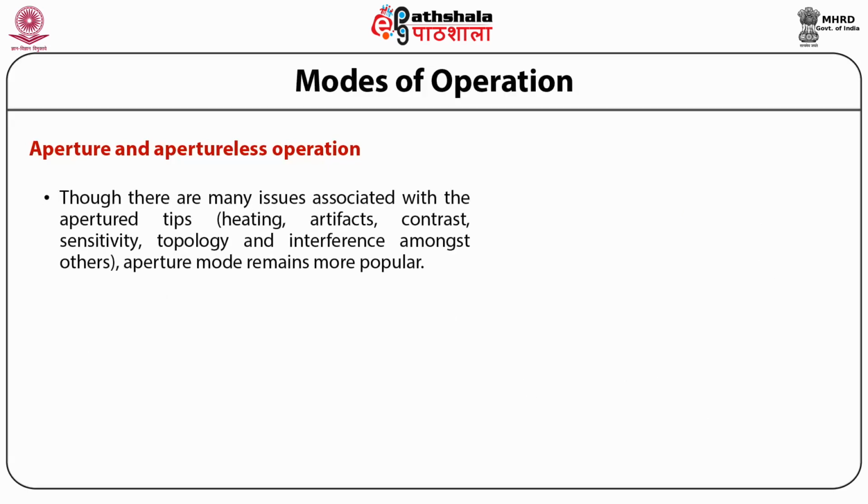There are many issues associated with aperture tips, that is, heating, artifacts, contrast, sensitivity, topology, and interference, amongst others. But still, aperture mode remains more popular.